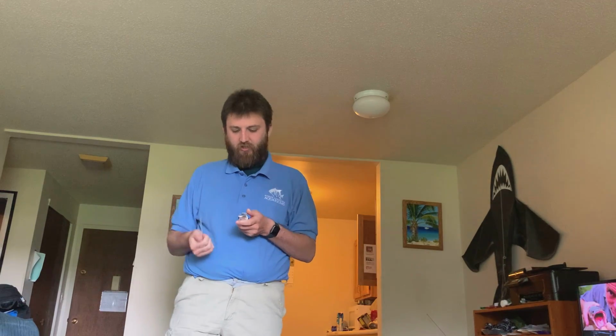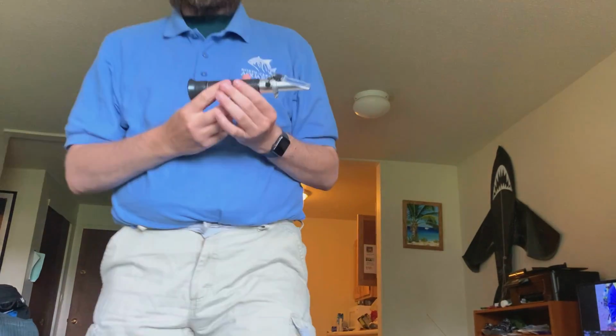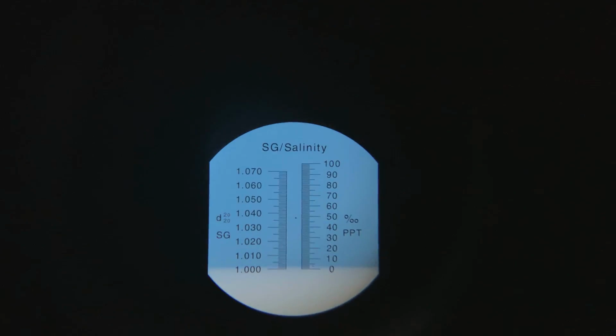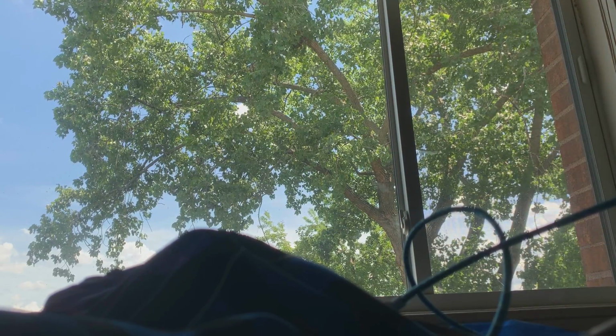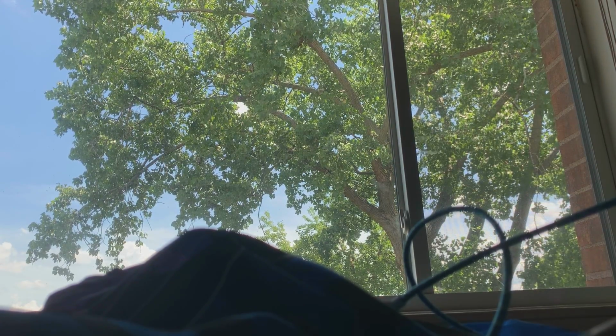You close it. And then you view it. And, well, as you can see, it is zero, effectively zero. Actually, no, it's a little bit higher. So, to calibrate it, there it is.